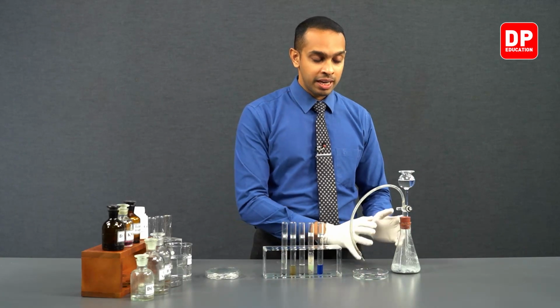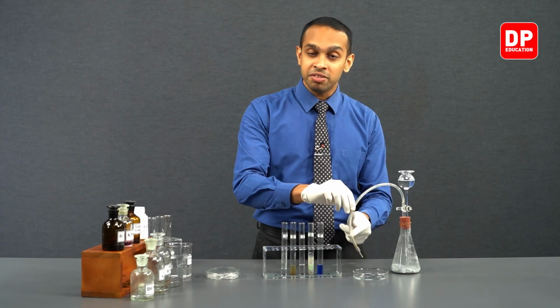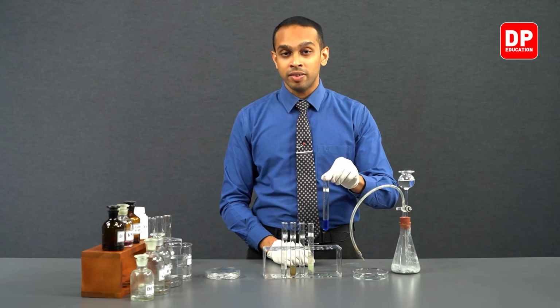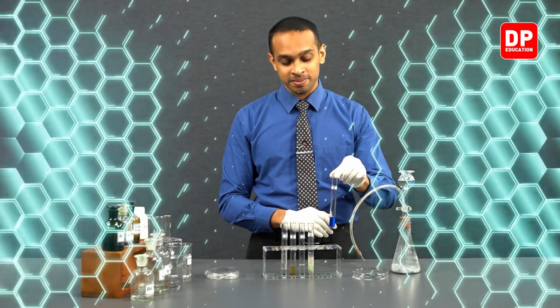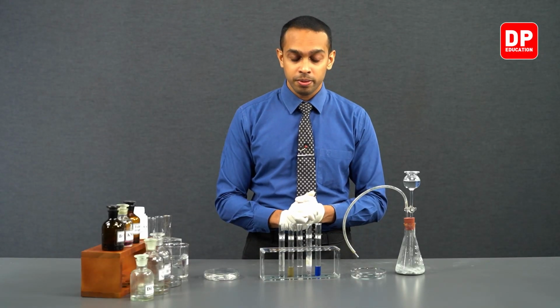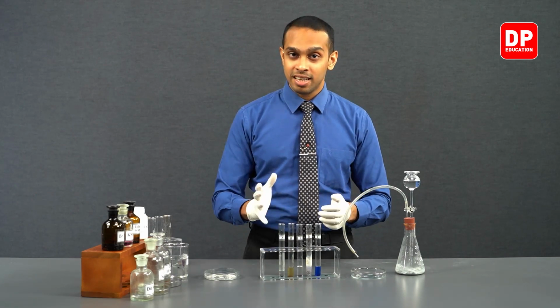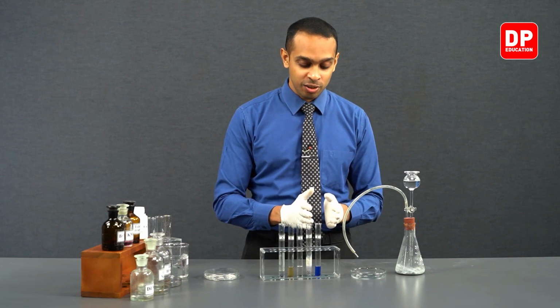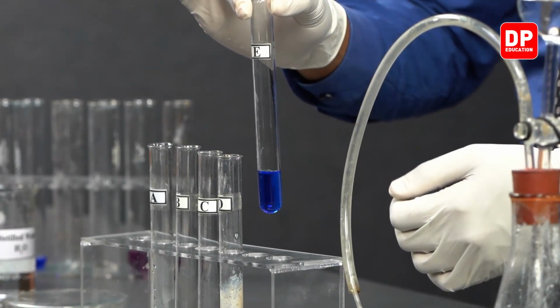Now we will take another calcium carbide sample. We'll clean the delivery tube and we will insert it again into our ammoniacal cuprous chloride solution. Students, now we have cleaned the delivery tube and we are going to produce acetylene gas again and send this gas through ammoniacal cuprous chloride, which is our blue color solution that we have here in our test tube E.